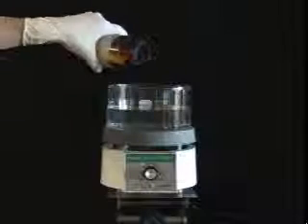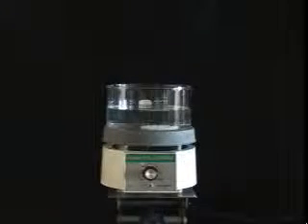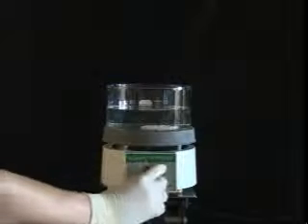Caution! Organic solvents are flammable. Never heat over an open flame. To set up a water bath, place a large crystallizing dish about half full with water on a hot plate. Add some boiling stones and turn on the heat. Don't turn it up all the way. Start halfway and adjust from there.